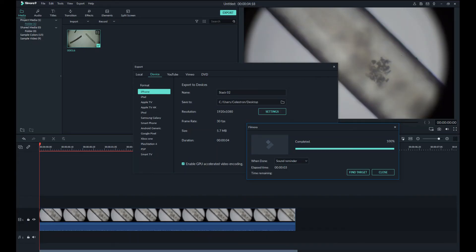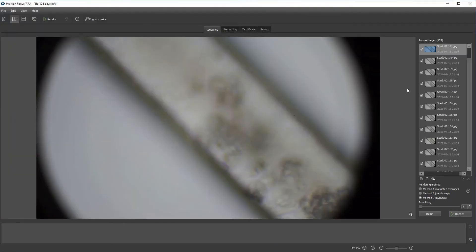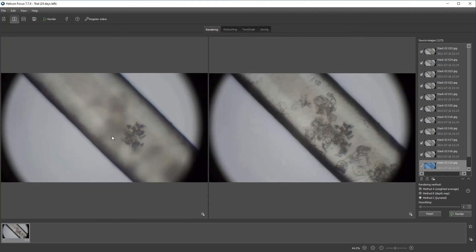So that was this piece of hair. We will take a quick look at the white hair also because it has quite nice structure I think inside it. So just focusing slowly through the whole depth of field. Then cut out the focusing piece of the video. I use the program Filmora 9 and here is the little piece that we cut out, about 4 seconds this time also. Then repeat the process in Helicon Focus 7. And here we got from the blurry parts with only a little sharpness until the big final picture that is sharp right through.